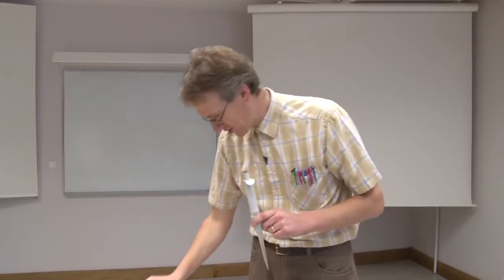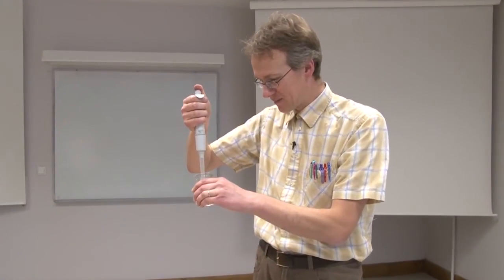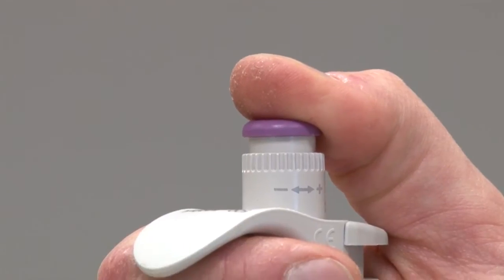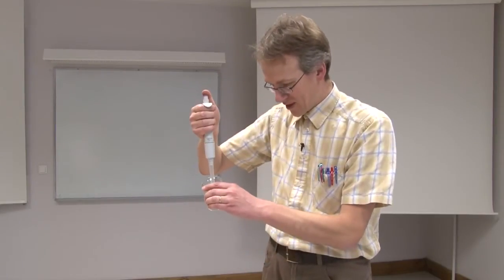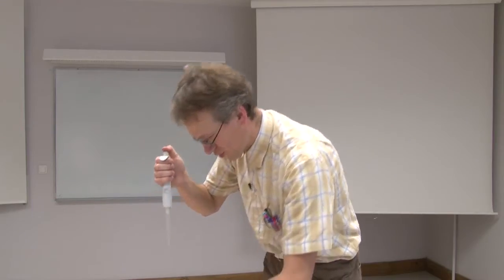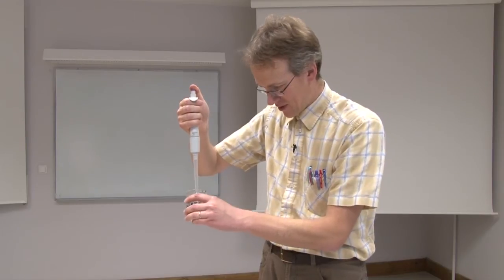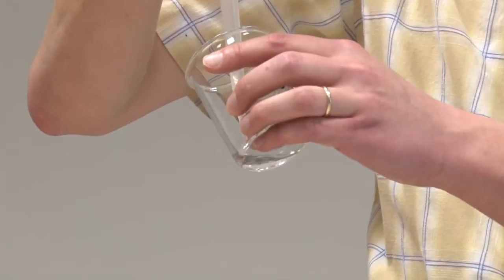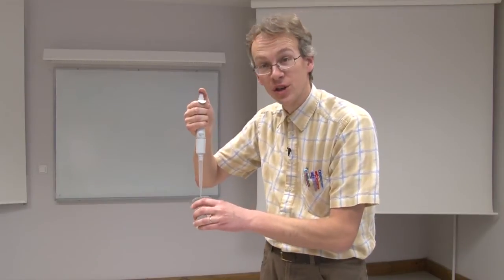I will first rinse the pipette two times and then pipette the liquid volume of 2.3 milliliters into the sample beaker. The pipette is held vertically and the liquid is aspirated into the pipette slowly. I release it into the waste beaker and push to the second stop. Again I push to the first stop, immerse, take the liquid slowly, and then slowly push to the second stop, touching the pipette tip either to the beaker wall or the liquid itself.